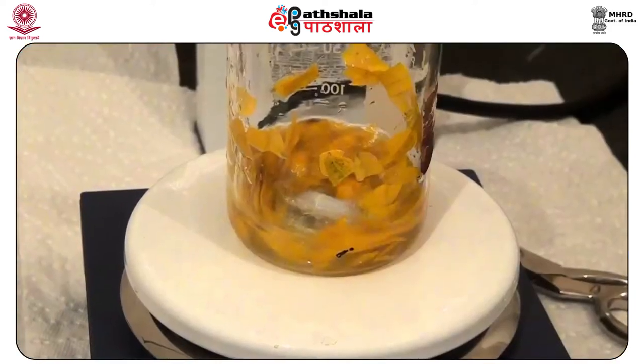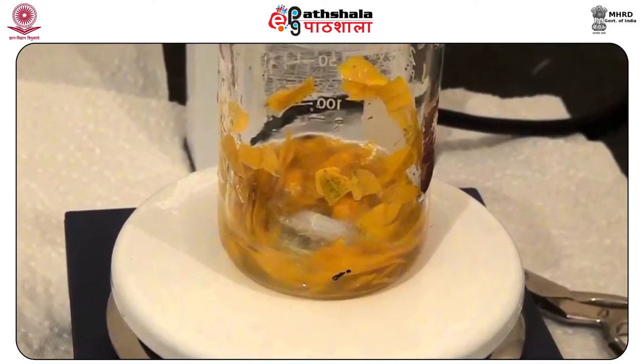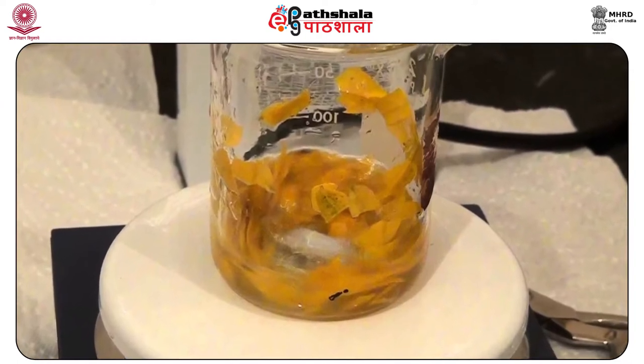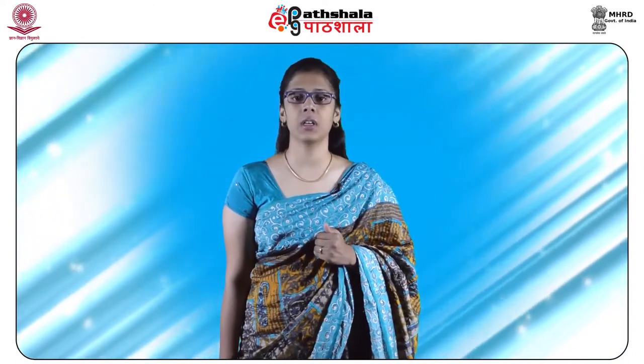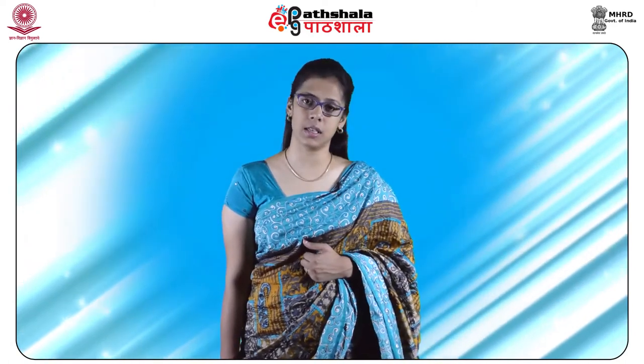First is the dye extraction. Dye extraction is the first and the basic step in the analytical process of dye and fibers. Varieties of solvents have been introduced for a number of extraction schemes. These extraction schemes vary but have basically the same aim, which is to not only extract the dye but also be classified by TLC, which was normally applied for the purpose of identification and separation.